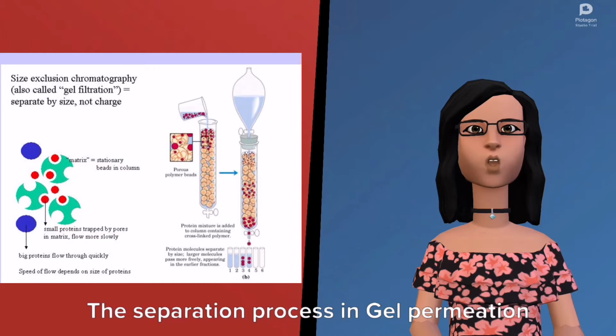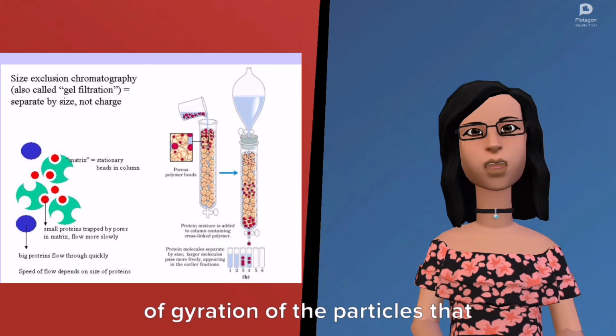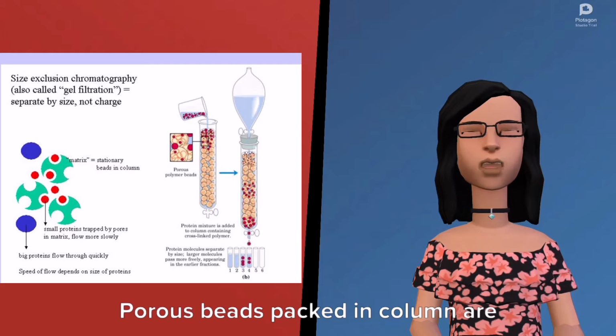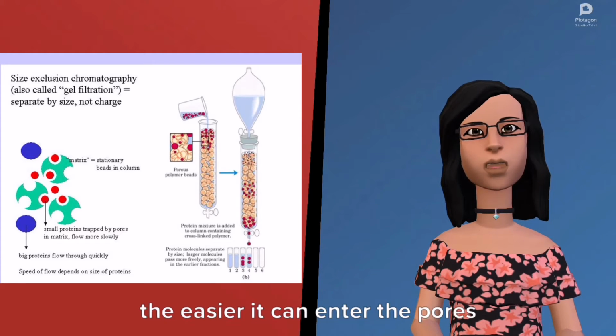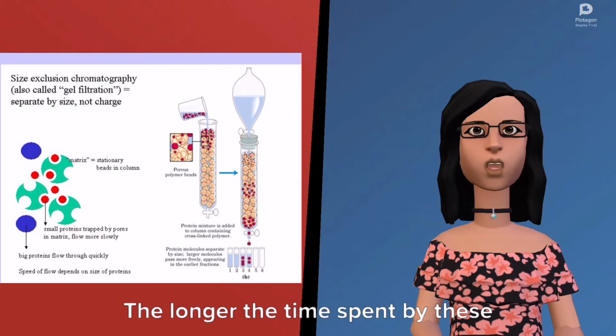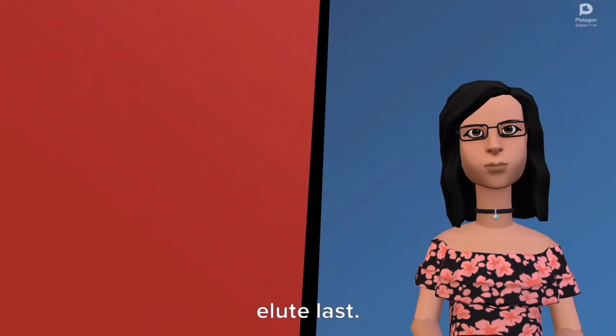The separation process in gel permeation chromatography is built on the radius of gyration of the particles that are to be separated. Porous beads packed in a column are used for separation. The tinier the volume of the particle, the easier it can enter the pores and the longer it can stay there. The longer the time spent in the pores, the later these particles will elute.